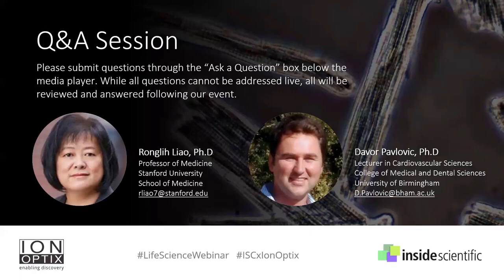I want to add one more thing. I completely agree with Davor, and I concur that our laboratory is also open for anyone who wants to visit and learn. And I want to share one thing. I think people, particularly beginners, think this is a very daunting task, and that there's no way they can do it. But so far, we have trained a lot of people, both in my laboratory and outside it, and our record is 100%. No one has failed to learn how to isolate a good cardiomyocyte. So there's hope out there, and don't think you cannot do it.